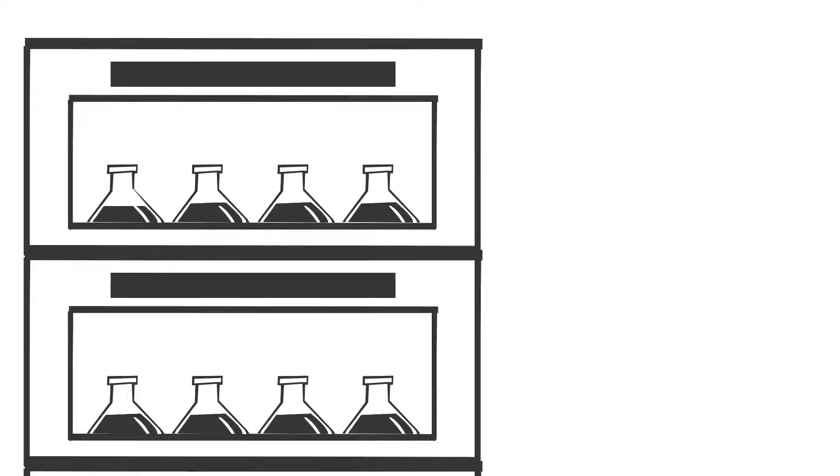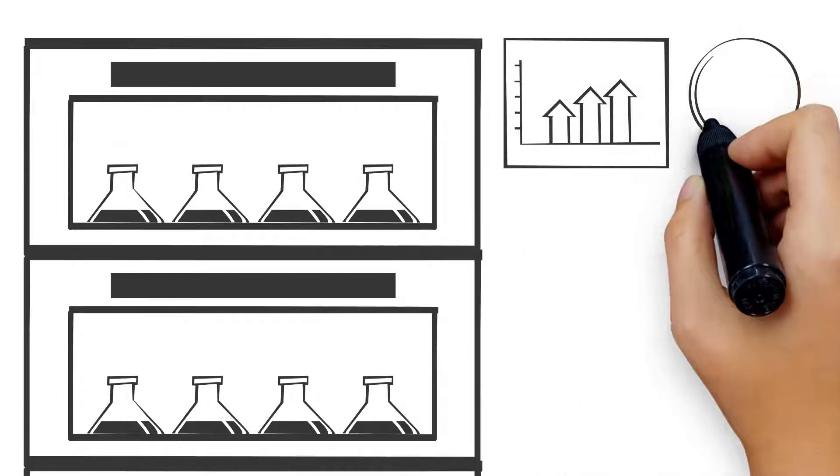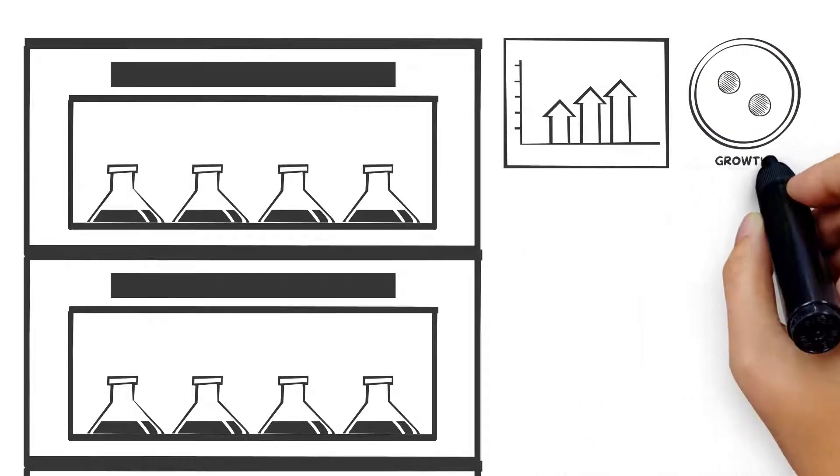During cultivation in an incubation shaker, water from the shake flasks evaporates gradually. This effectively increases the concentration of your culture medium, which can result in growth limitations.